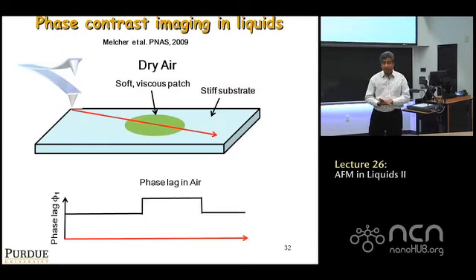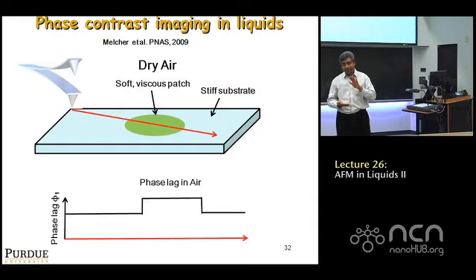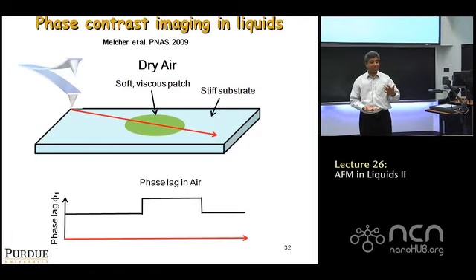On the other hand, I think you've seen already now that in liquid especially, there's a lot of energy loss that goes into ringing or the internal degrees of freedom, right? In fact, you've already seen this simple hypothetical example, where the interaction forces could be completely conservative, and yet you would see an energy loss because as the ball hits and goes away, you get a pulse, and it causes the internal degrees of freedom to ring. And so it doesn't fly back to the same height.